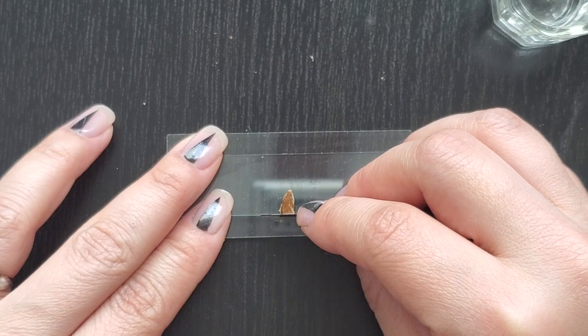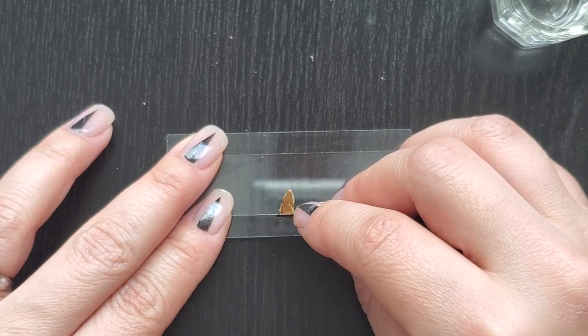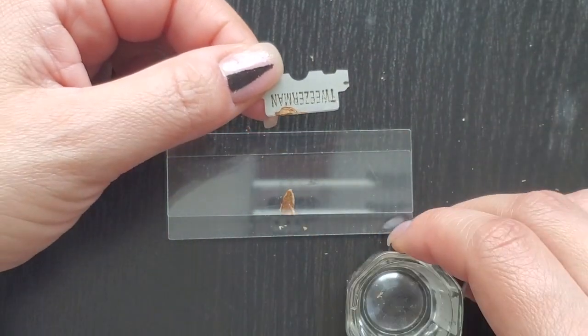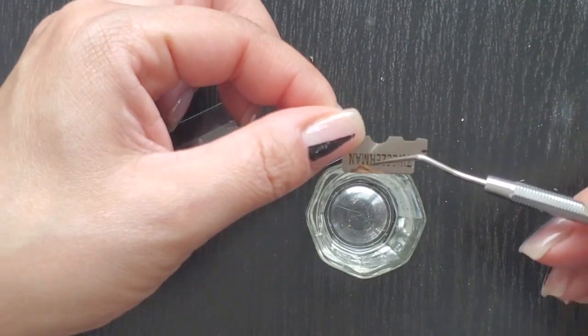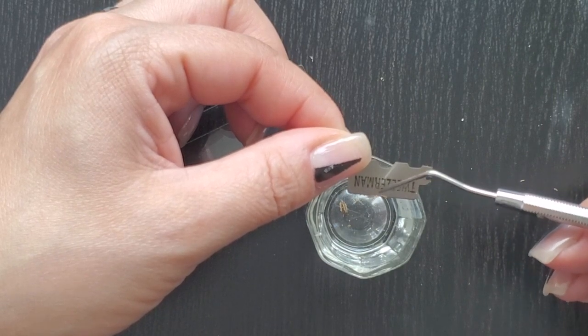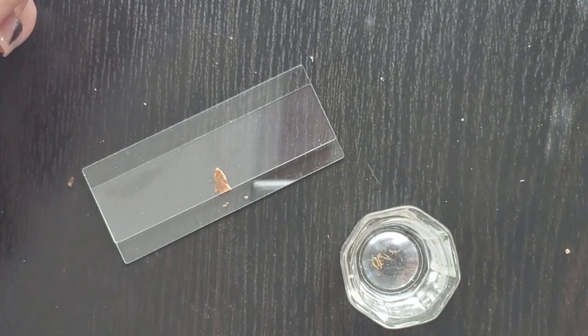Now I don't do a sawing method, I just go straight down like you're chopping onions. There's a whole bunch here. I think you can see them.